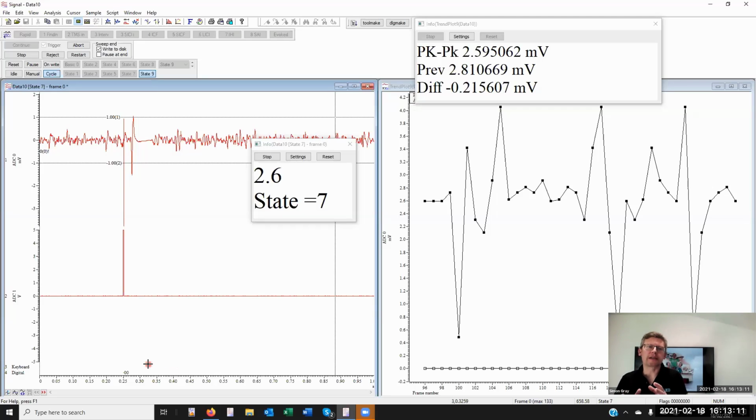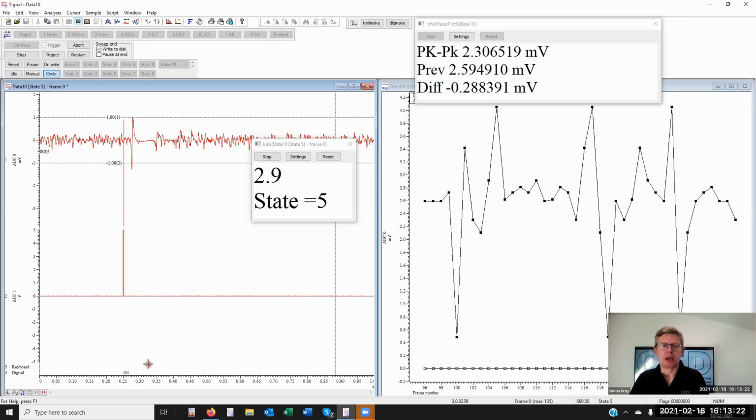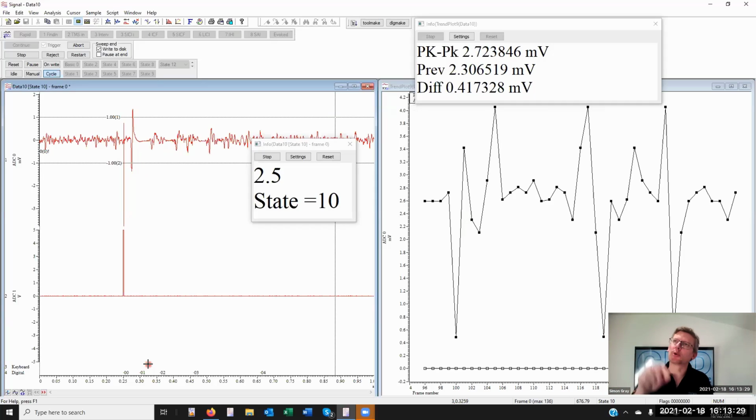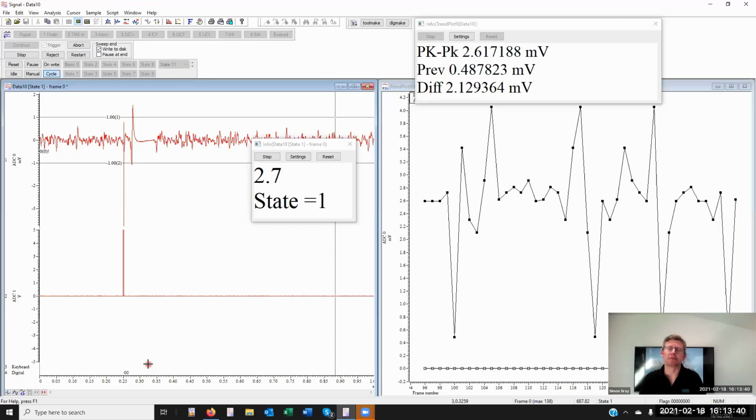Now, the data collection here is happening too quickly for me for this frame length. If you're dealing in gap-free mode, so virtually a continuous data capture, or have longer sweep lengths, then I can see the point of having the keyboard channel there, where you might want to mark something, an indicator that something had changed perhaps, or some reference point in the frame. So that's the keyboard channel, and I hope that answers your question.